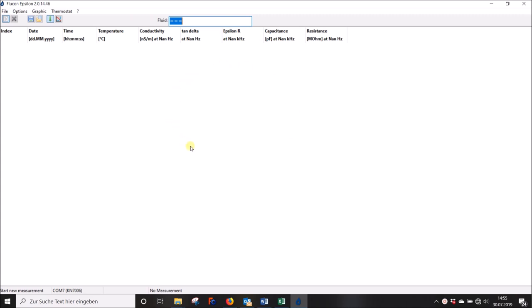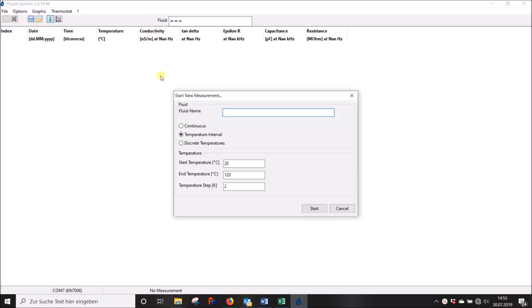This is what the program window looks like. Start a measurement by clicking on File or on the empty sheet symbol. Now this screen will pop up asking you to fill in a fluid name for your sample.